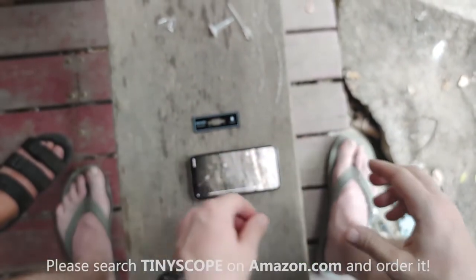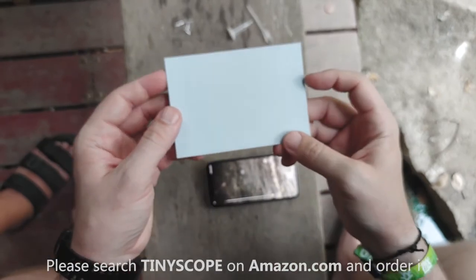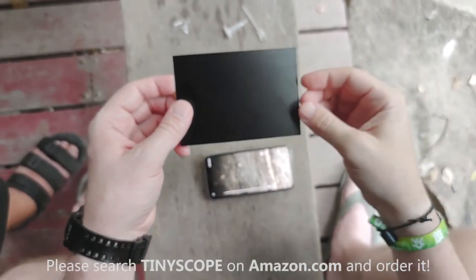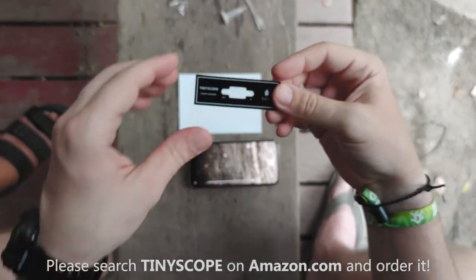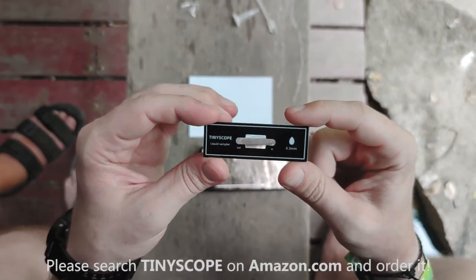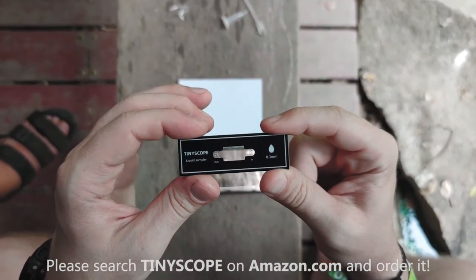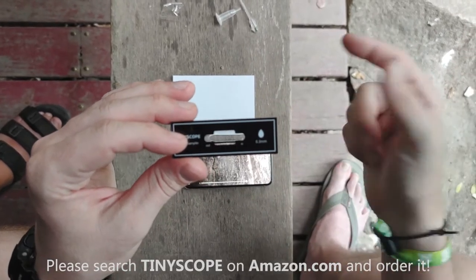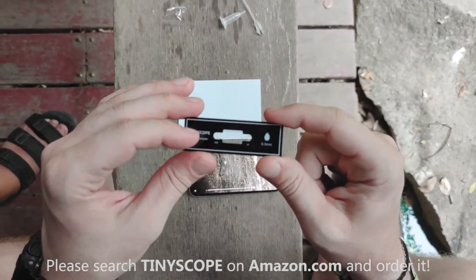Now we need our background sheet. This comes with every kit — it's white on one side and black on the other. If you're looking at lighter-colored specimens, use the black side; for darker colors, use the white side. Every Explorer's Kit comes with 0.3 millimeter slides. We found that 0.3 millimeters is the most suitable size for viewing average pond, lake, or river water. Larger or smaller slides are also available on our store depending on your needs.